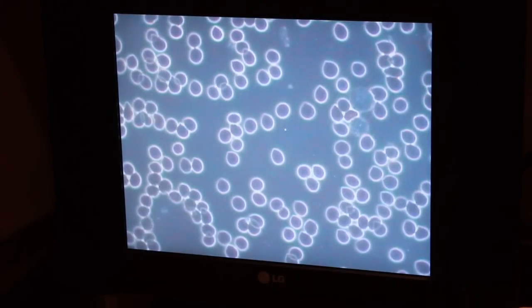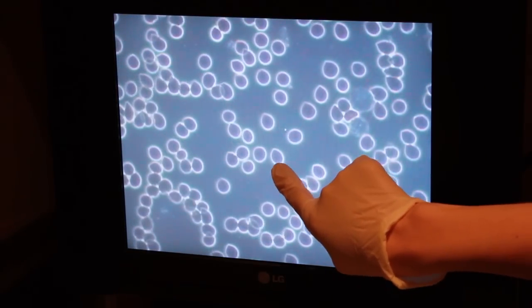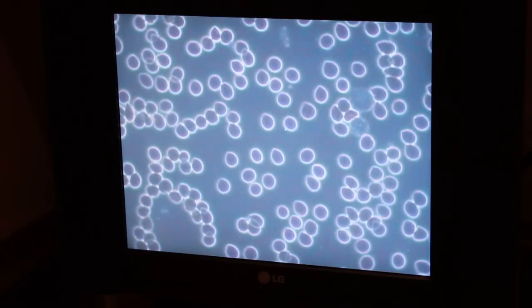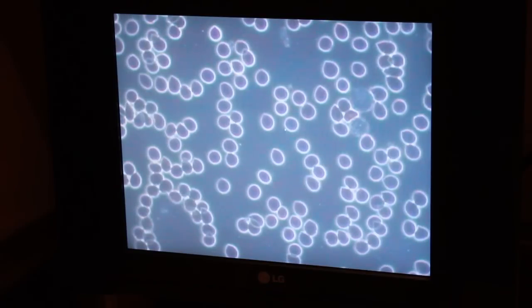We're looking at red blood cells and white blood cells in the bloodstream. Red blood cells are these fellows with the nice bright white circles with the dark centers. What we want to see is that they're nice and round and that they're moving fairly gently through the bloodstream.